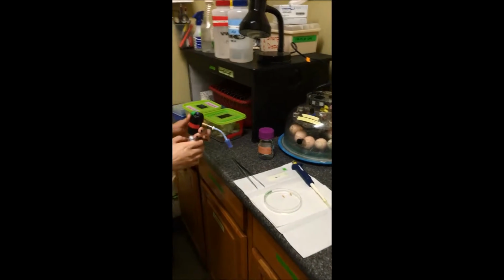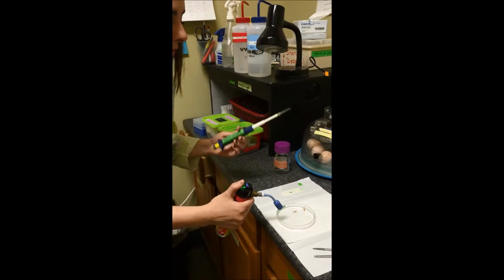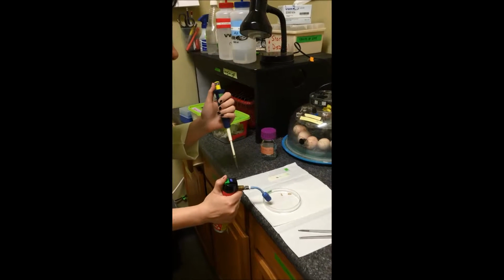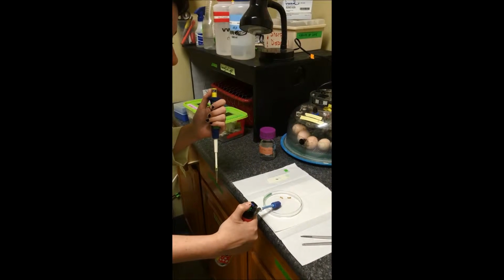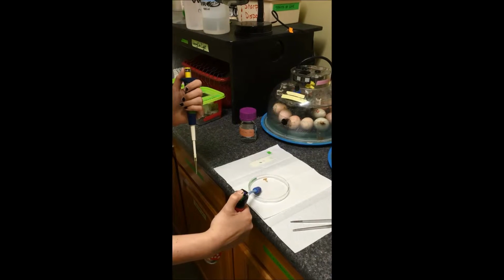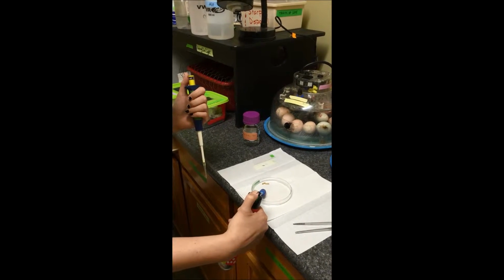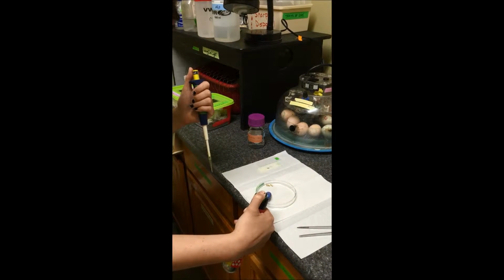Okay, cool. So to get them to give us a nice gut bacteria sample, we use some CO2 in this canister, and we give it a light spritz on the top. What it does is it kind of just puts them under anesthesia for a little bit, and when they do fall asleep, they'll fall on their backs, and they'll poop.